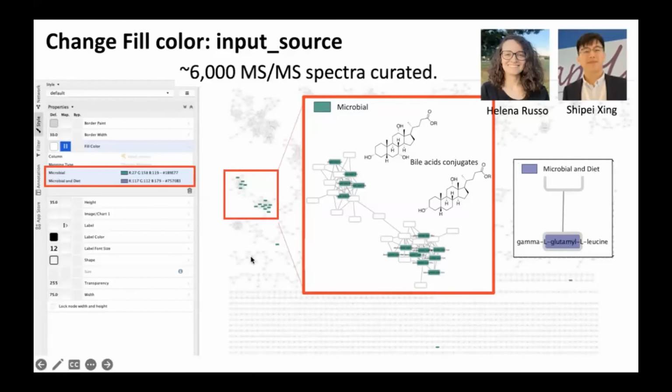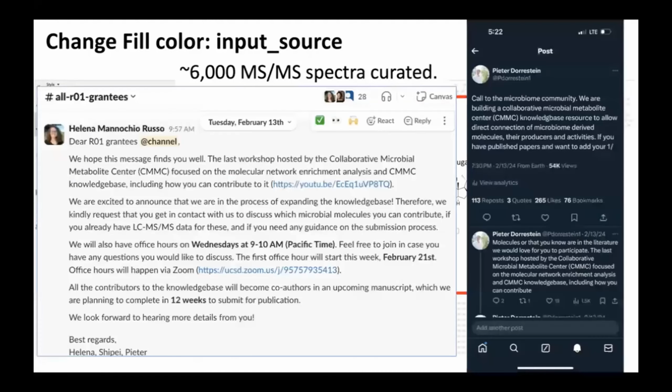But notice how many nodes are still not colored. That's because the reference database right now, although it's pretty good, with 6,000 MSMS spectra curated, is just a small drop in the bucket. And this is really where we need to bring the community together and say, hey, can you help curate it? We've started to make these calls to begin curating this knowledge base with the larger scientific community.